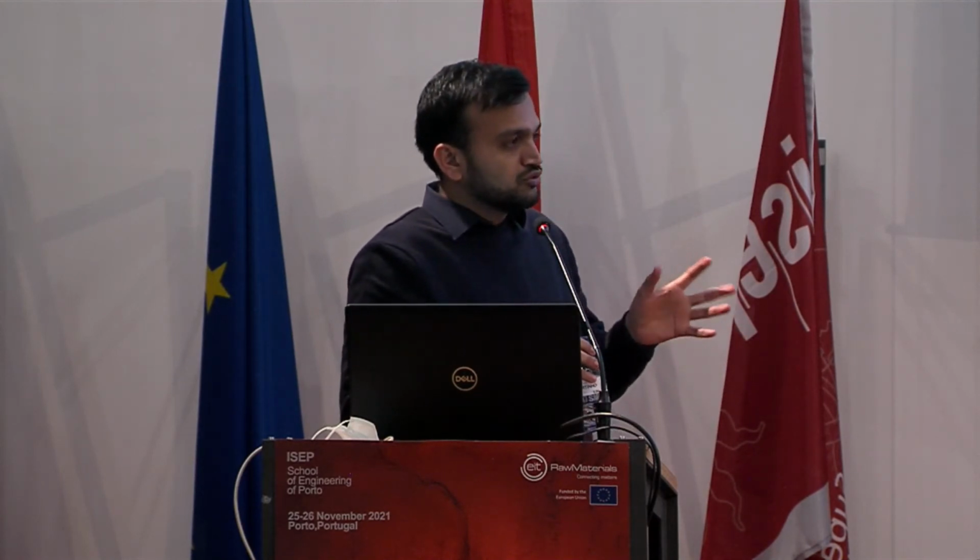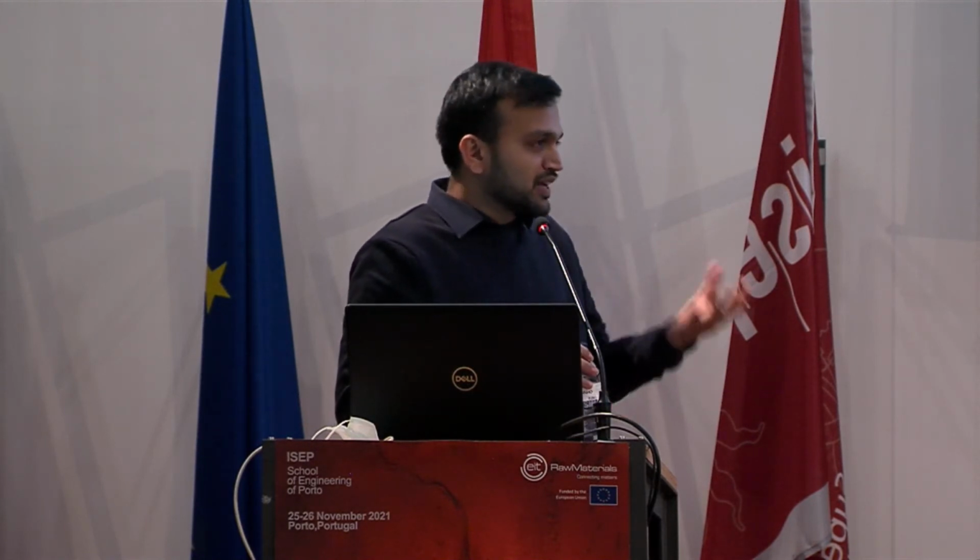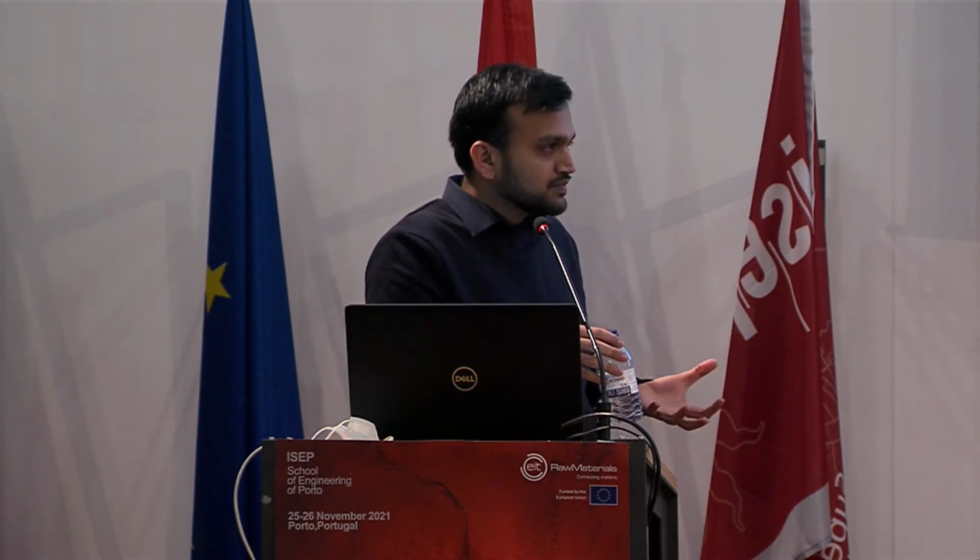We're trying to do those things first on a software platform. Then we will mimic a condition in a real environment. Then we'll optimize the dimensions based on that.